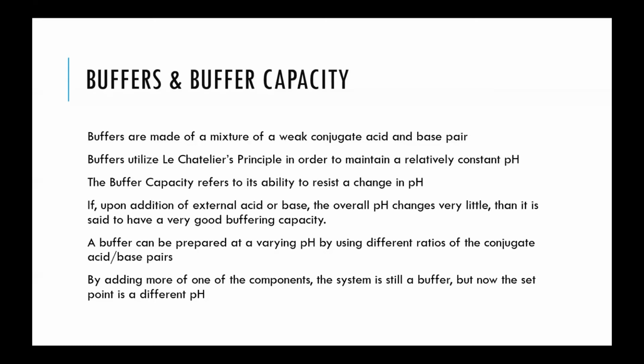And in the lab, you're going to be preparing two buffers and looking at their buffer capacity relative to each other. Which one changes pH the least when you add acid? Which one changes the pH the least when you add base?